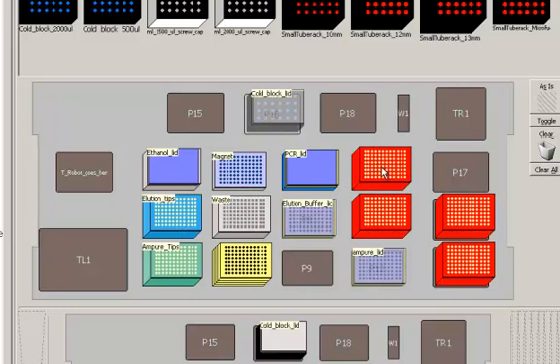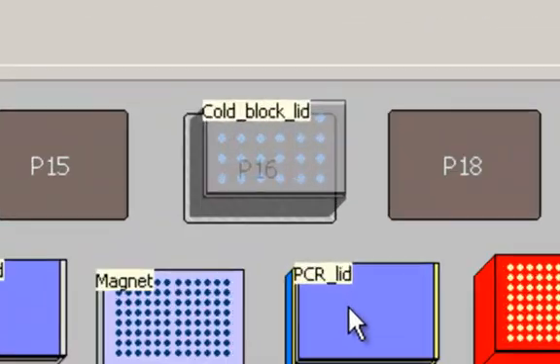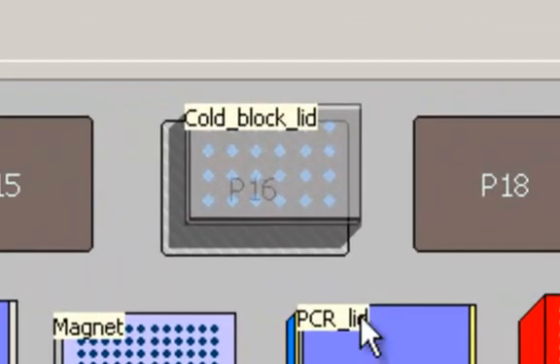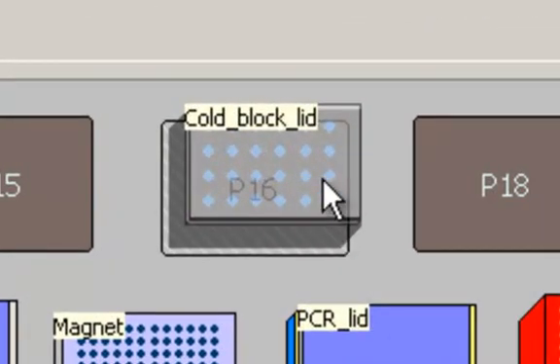We have boxes here of 50 microliter tips. These tips are used to add your master mixes to your sample plate. If you're at the beginning when you're doing the end repair, it's going to use these tips to transfer from the cold block to your sample plate.